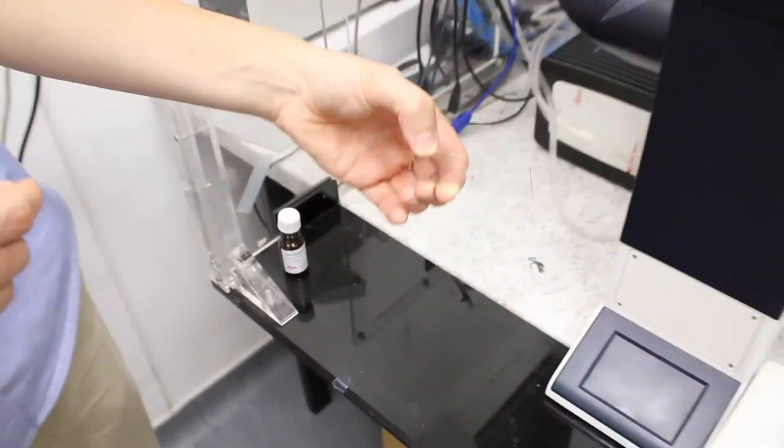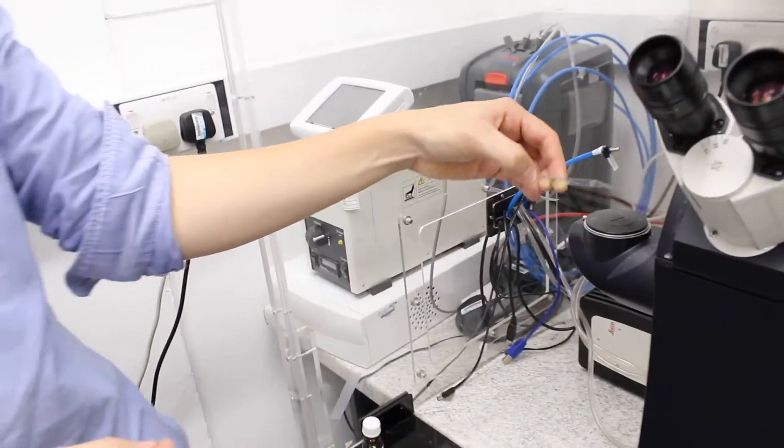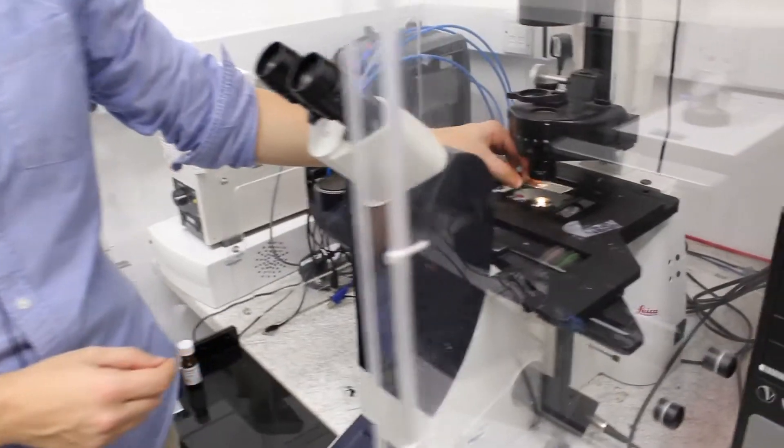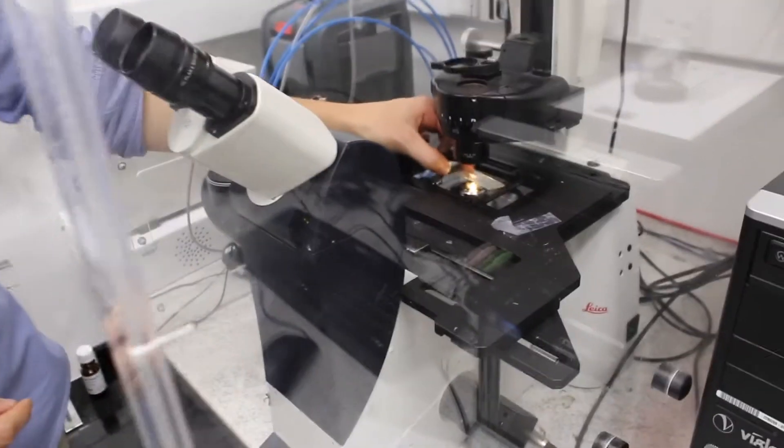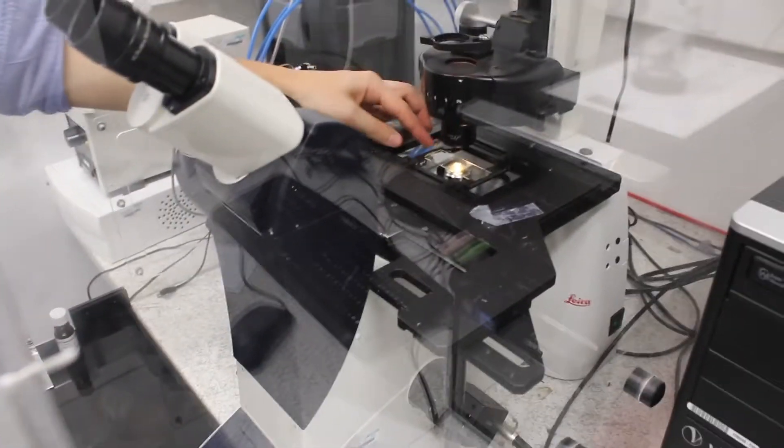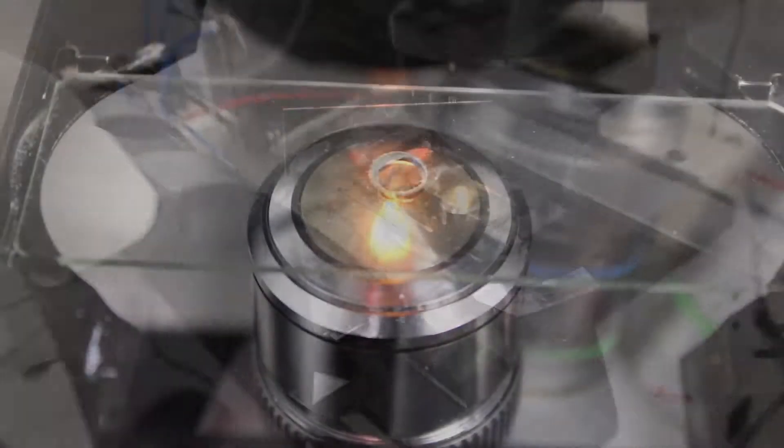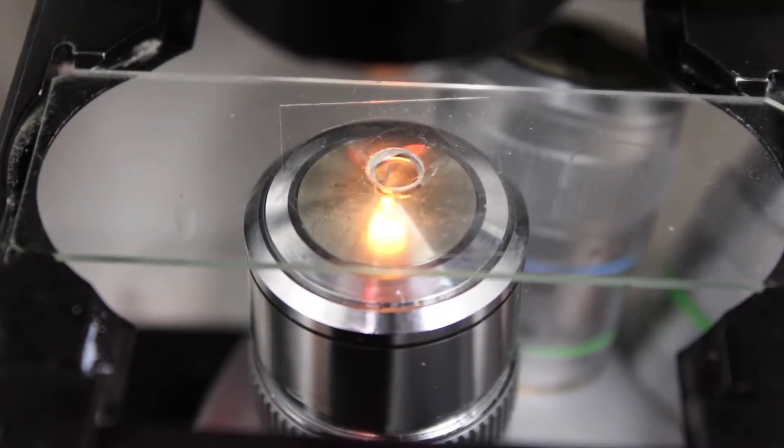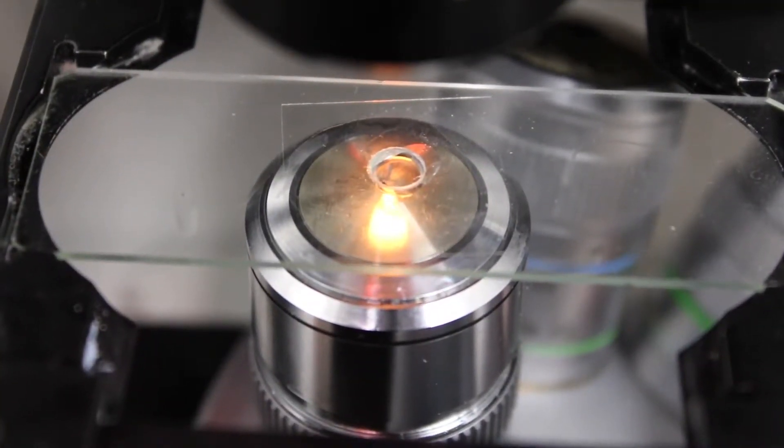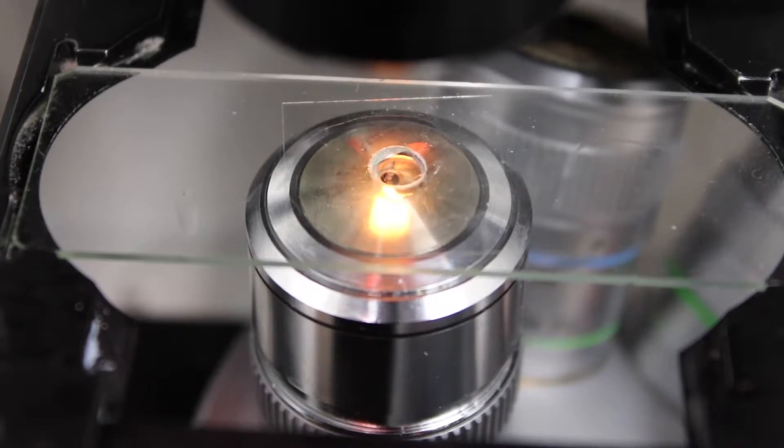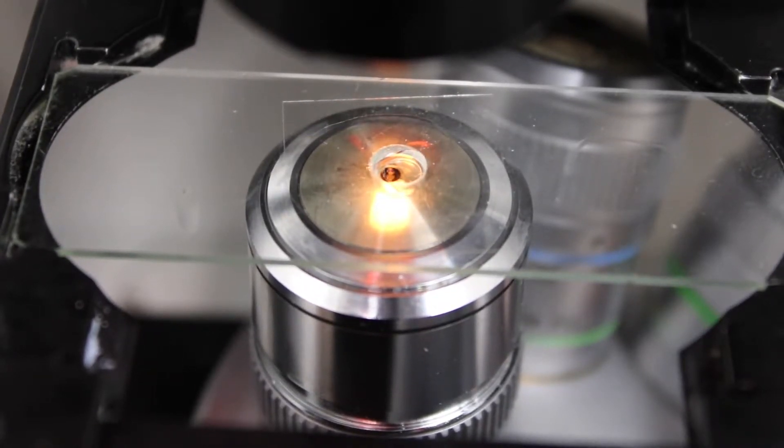Then you put your sample on the sample stage, and then you approach slowly the objective to the sample, and you will see when the objective has touched the oil.